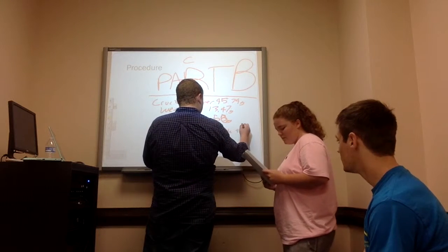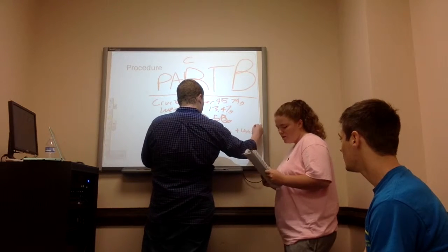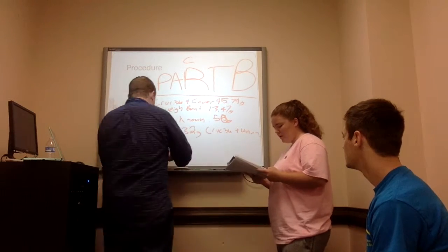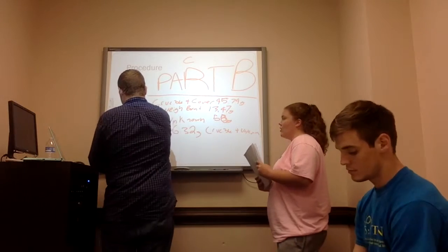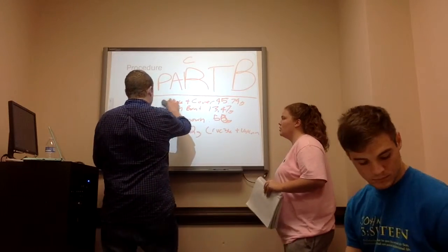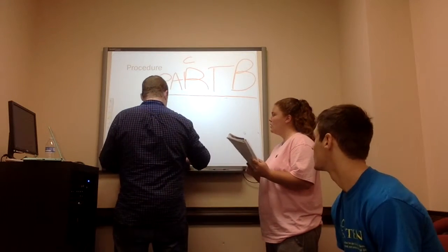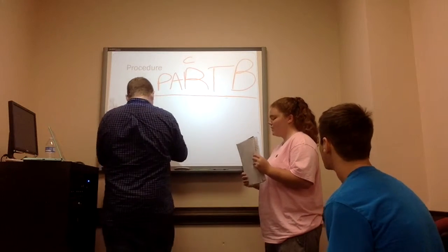And after that, we placed the crucible with the unknown on the Bunsen burner because you didn't have a hot plate. And you heated it, correct? Yes, but you didn't put the lid all the way on there securely. You left it kind of ajar. Is there a reason for that? So that the stuff can escape.